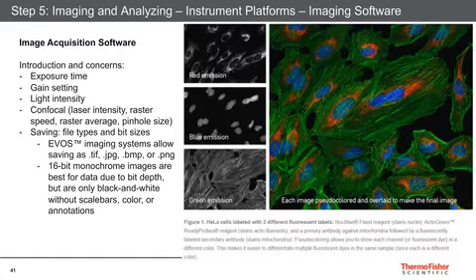Now, as you're taking your image on your microscope, usually you have some sort of imaging software. This software helps you take the image and helps you combine the different colors into one. And there are some very important aspects to keep in mind to get a publishable image.